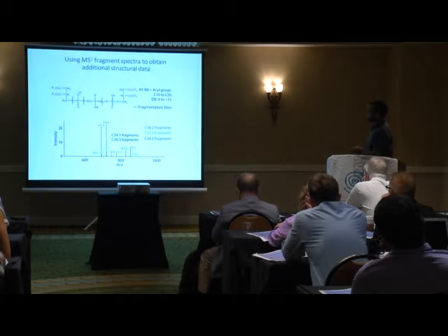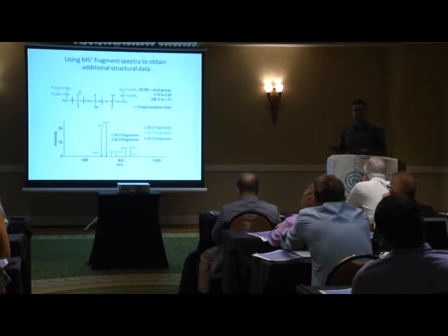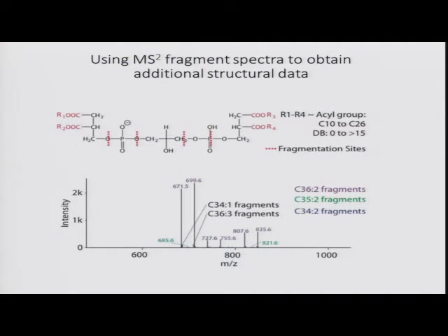Additionally to these main peaks here, we have minor satellite peaks that you maybe barely can see on this projection, but these originate from the fact that when you look at the distribution of double bonds between the 2 sides, you can have either, for this species, 2 on the left and 2 on the right side, or you can have 3 on one side and 1 on the other, and you will still get the same isobaric species. Of course, analyzing one of these spectra by hand takes several minutes to attribute all these peaks, but it is possible to do that.